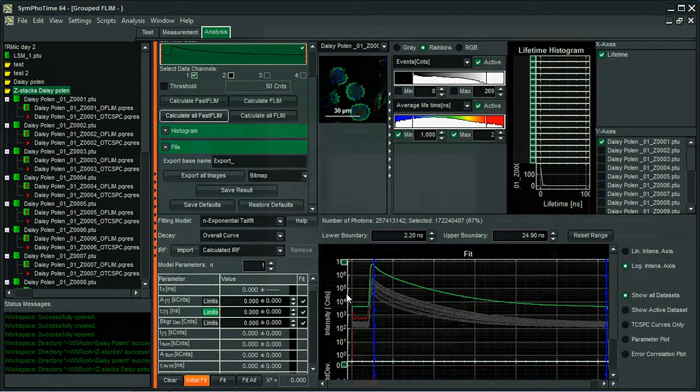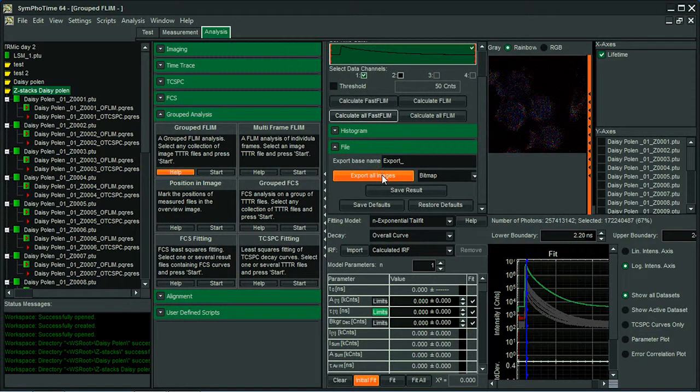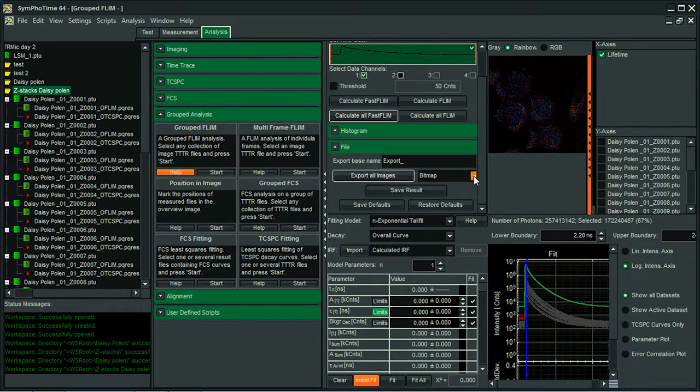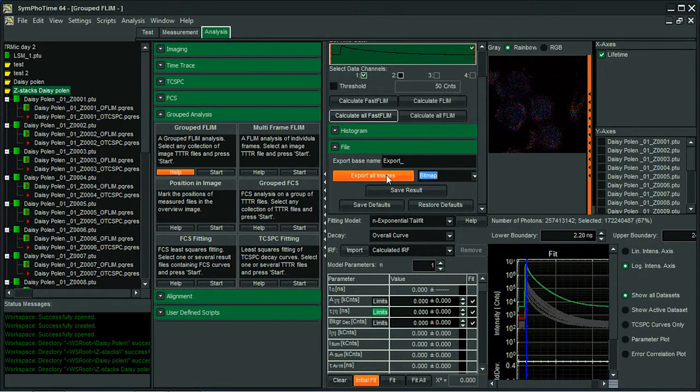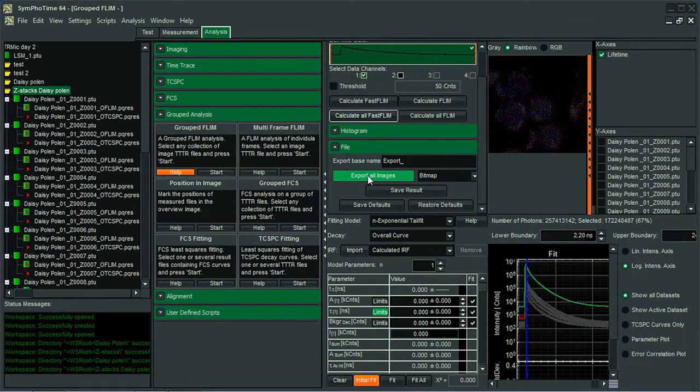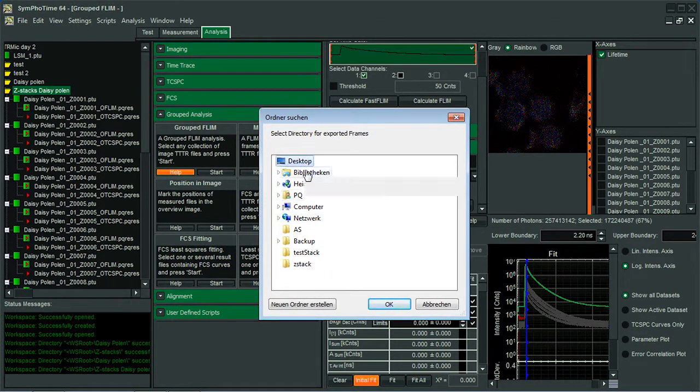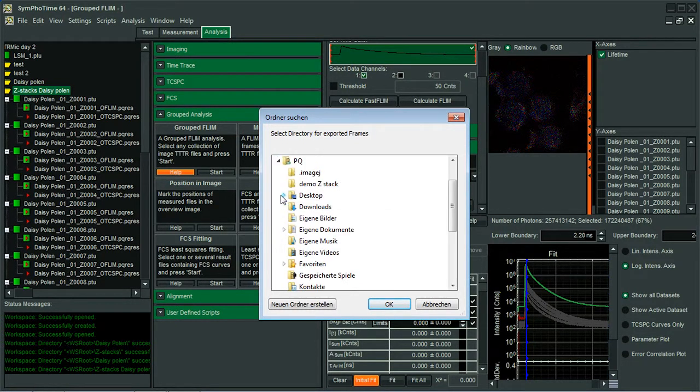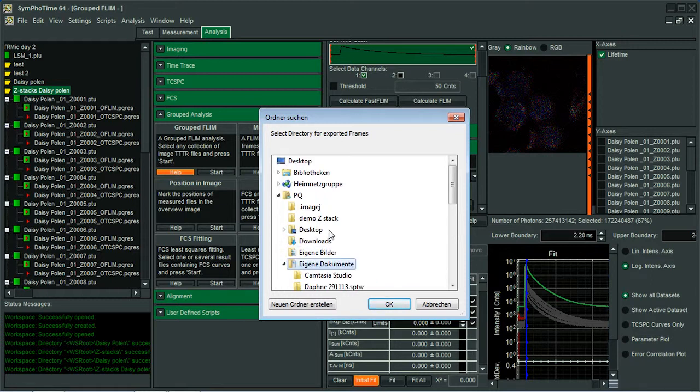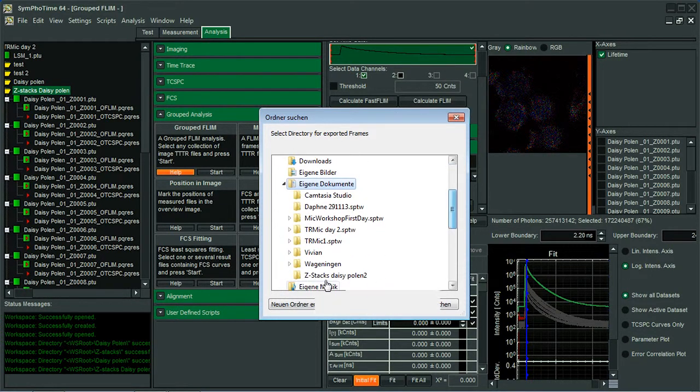And then I go to export all images. And previously, I select the format I want to work with. For example, in this case, bitmap. I select in the computer where I want to store that data. So I go to the PicoQuant folder and documents. And I will create a folder that will name, for example, export.